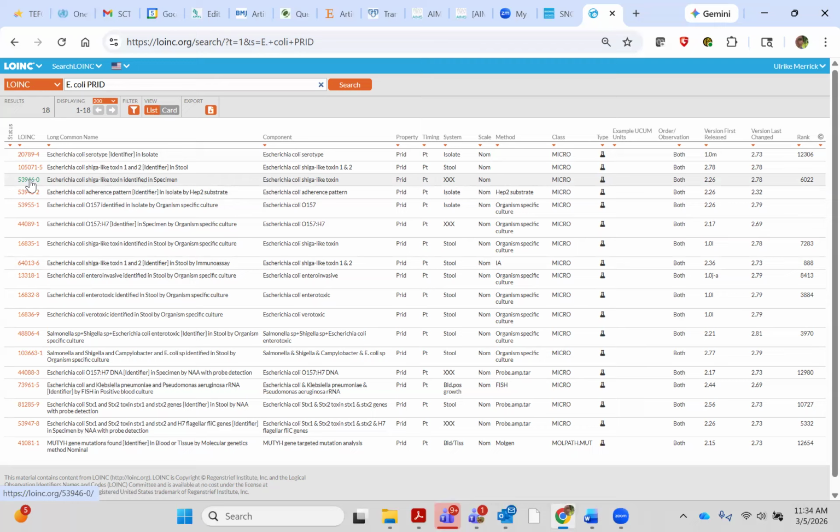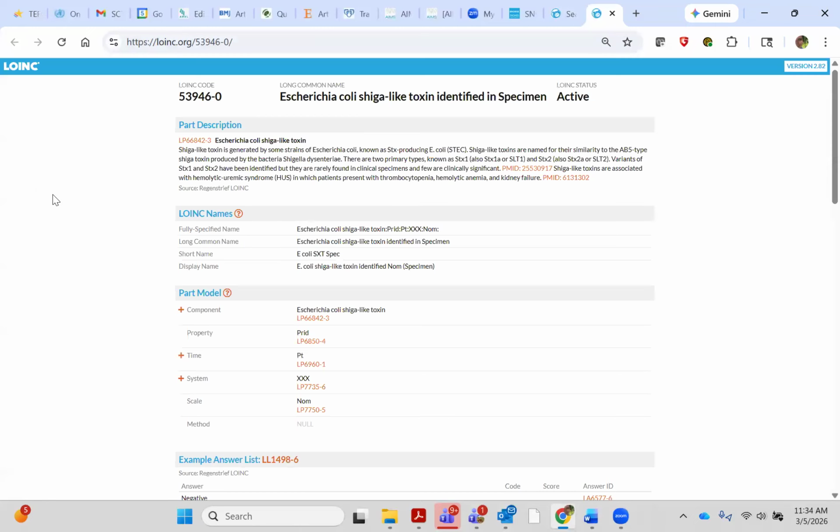And to me, that's a finding of what was isolated, not an organism, if that makes sense. So organisms are what is isolated. When you make a statement in SNOMED about what was not isolated, that's actually in the clinical findings hierarchy, not in the organisms hierarchy.